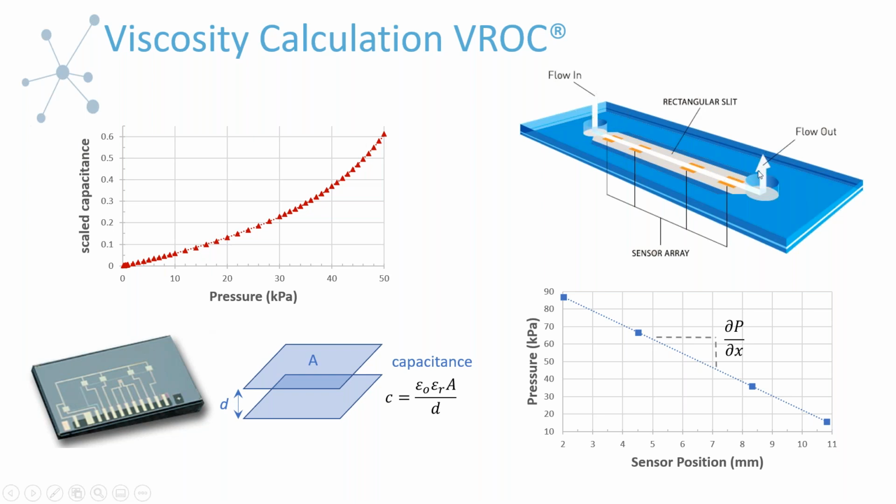Here's a cartoon of our flow channel, where beneath the flow channel are 4 pressure sensors. And this is a more realistic diagram down here in the corner of the bottom side. So if I took this flow channel on the top and flipped it over, now you can see the presence of these pressure sensors that are beneath our flow channel.